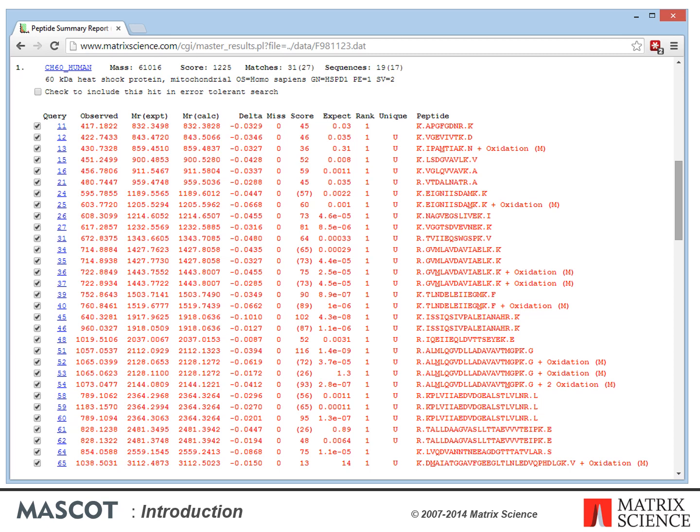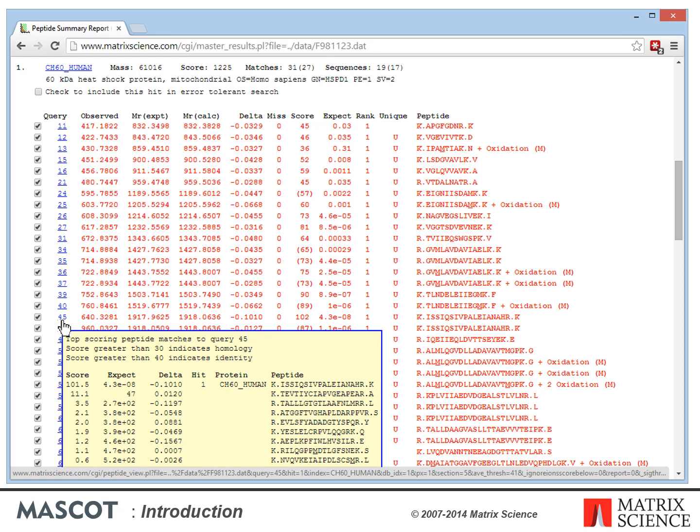The results from this type of search tend to be more complicated to report because they usually represent a large number of MSMS spectra. We match peptide sequences to individual MSMS spectra, then try to assign these peptide sequences to proteins, aiming to report a minimal list — the shortest list of proteins that accounts for all observed peptide matches. For each spectrum there may be multiple possible peptide matches. For example, a phosphopeptide may have several potential phosphorylation sites where moving the phosphate from one site to another only changes the score slightly.